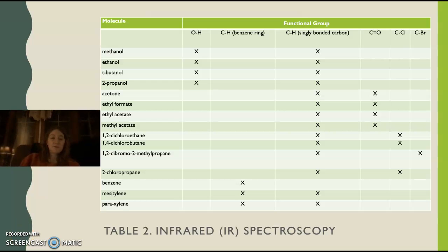This is table 2, infrared spectroscopy with all the values and the checked values. This is a table that was used to refer back to, just like the one on the slide before, the NMR. This was also used for all the other unknowns as well.